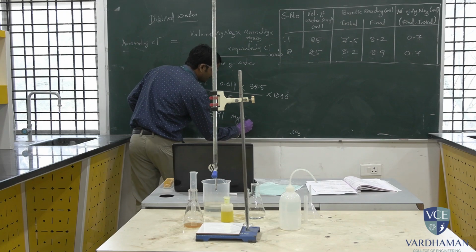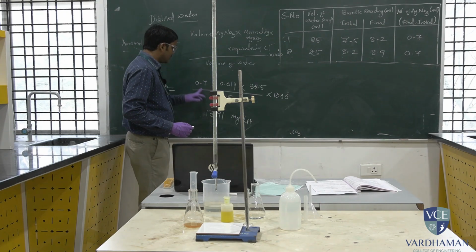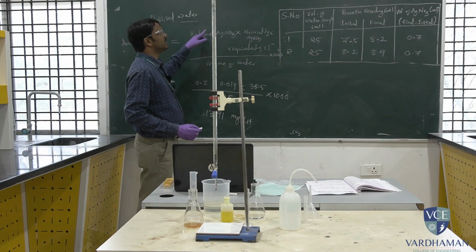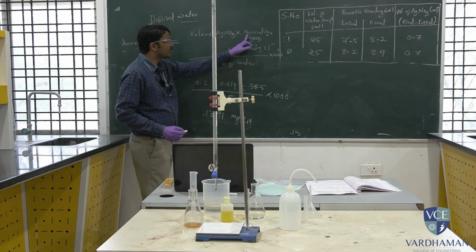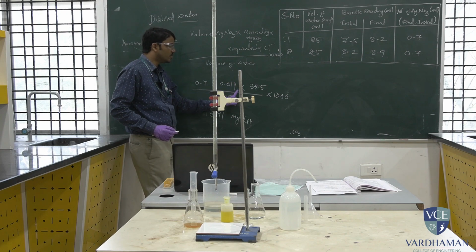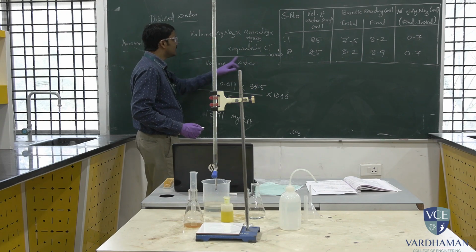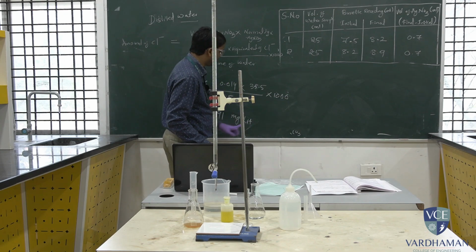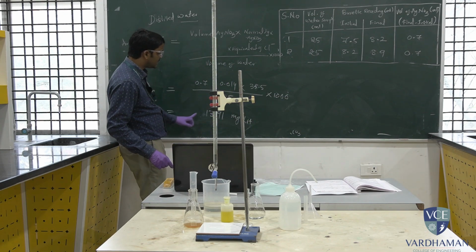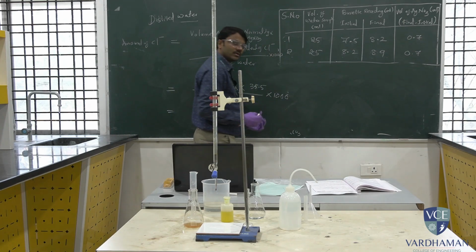So now we are going to conclude this experiment. The consumed volume of silver nitrate is 0.7, the normality of silver nitrate is 0.014, and the equivalent weight of chloride is 35.5. The volume of water we have taken for this experiment is 25 ml, multiplied with 1000. So we got 13.91 milligram per liter.